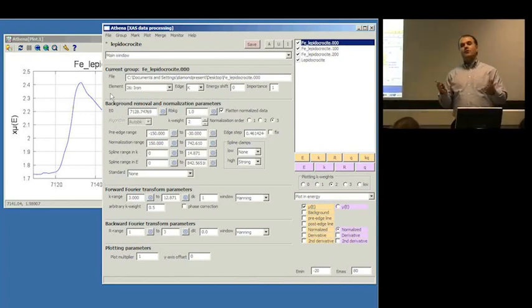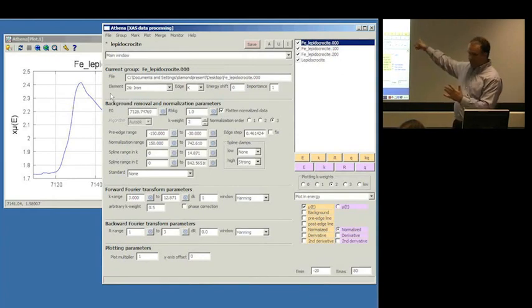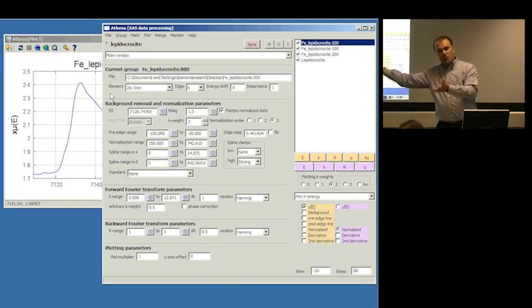That is just a parameter that's used to line up the zero of K that you choose at this point with whatever the zero of K is in the theory. So there will be an opportunity to correct that number in the future part of the workflow when you go off and analyze the data in Artemis.